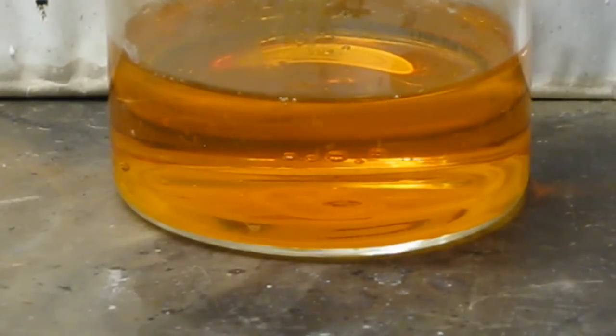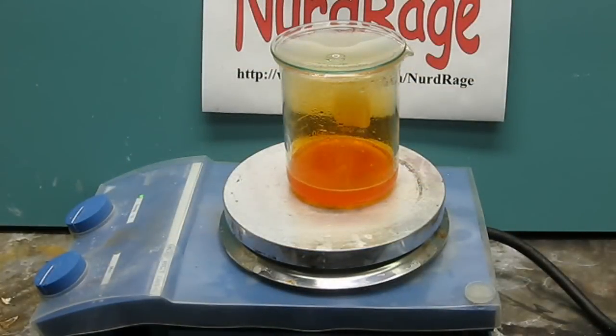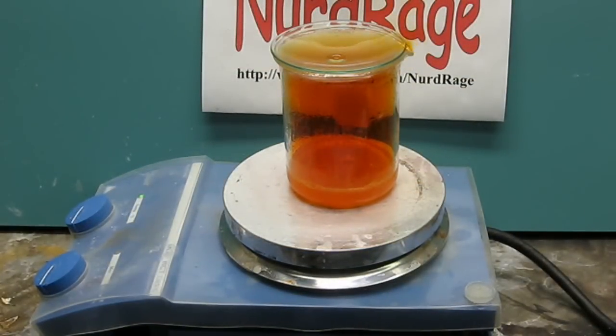The conversion from chloride to nitrate will proceed on its own. To speed up the reaction you can also boil the mixture. The brown gas is the nitrosyl chloride decomposing and producing nitrogen dioxide and chlorine. You can tell the reaction is over when the gas clarifies, indicating it's no longer producing nitrosyl chloride and nitrogen dioxide.